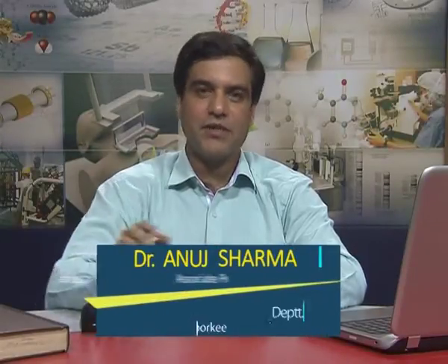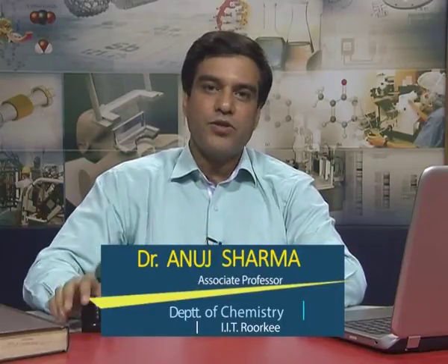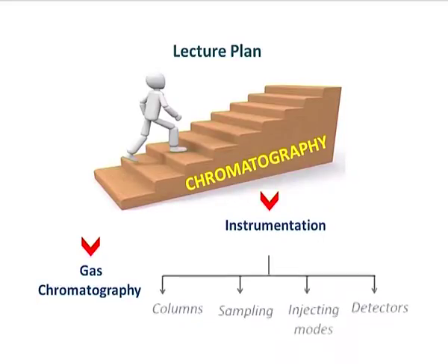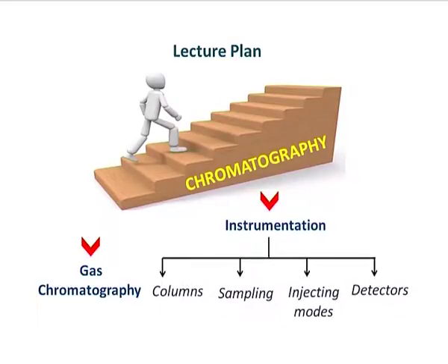Hello and welcome to this next lecture in Purification and Separation methodologies. In today's lecture, we will study a very important chromatographic method, which is gas chromatography. In this method, we will learn about the details of the instrument, the gas chromatographic instrument. We will find out about the columns which are used in this method, the sampling, injection modes, and finally the detectors used in this important methodology.